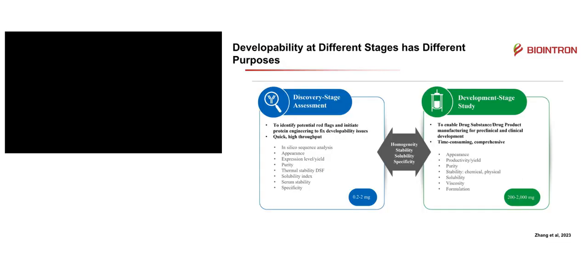So the scientists introduced the concept of a discovery stage assessment because before we were talking about development stage assessment, including stability, chemical and physical stability, solubility, viscosity, and formulation. And since we're working on more and more difficult molecules, we want to move the development stage earlier, including in silico sequence analysis, thermal stability, and serum stability and specificities.